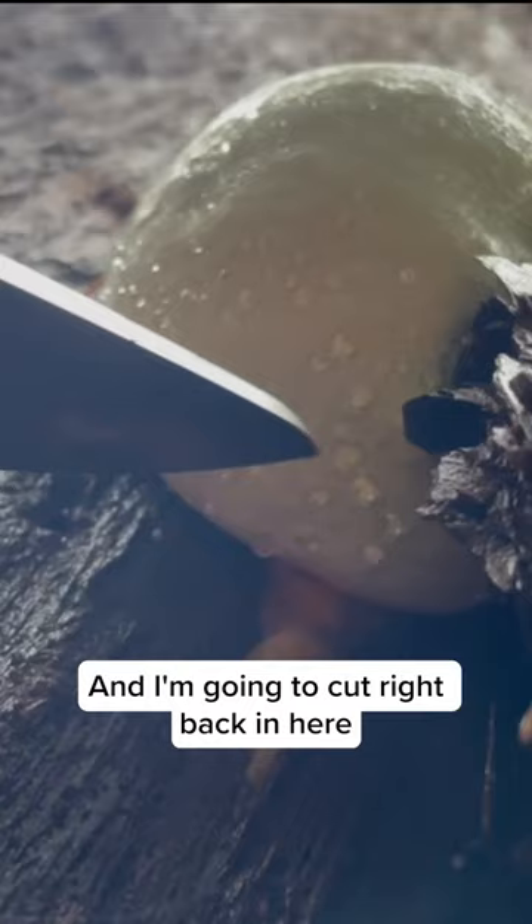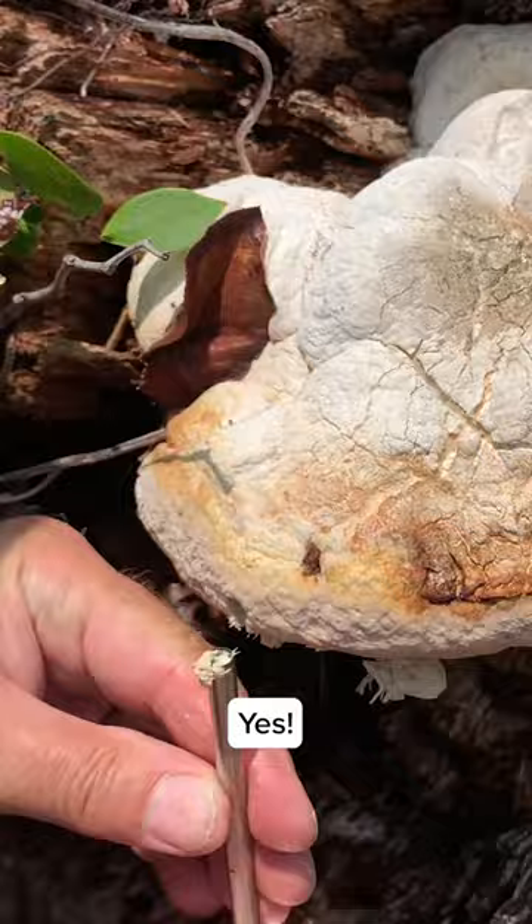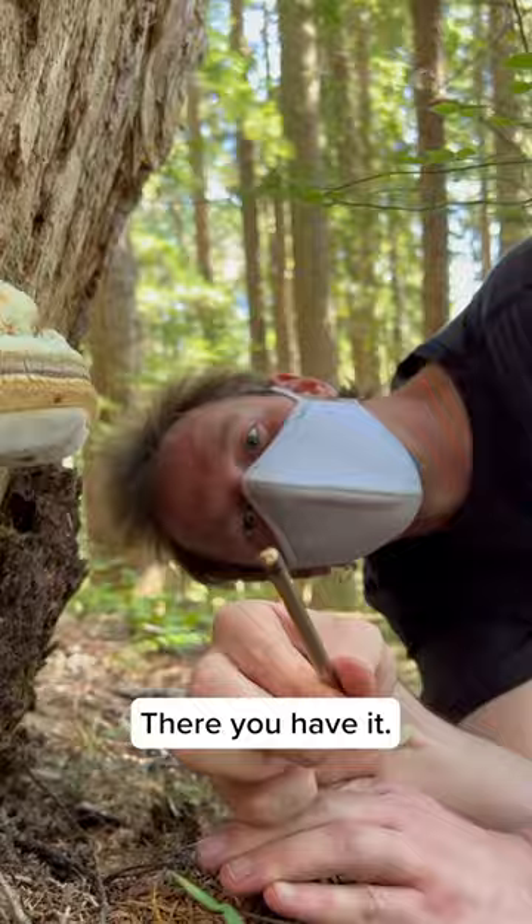I'm going to cut right back in here to get a little chunk. We know this will reheal. That's all I need. There it is. That's all the tissue I need.